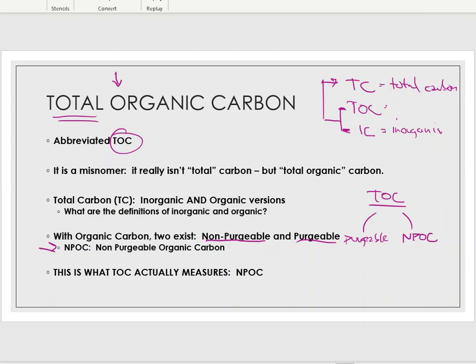So again, you know that's going to be an assignment question. You make sure that you study that up, make sure that you know what it means, because NPOC is actually what we are really measuring in this instrument. Okay, so that makes this process even more confusing.